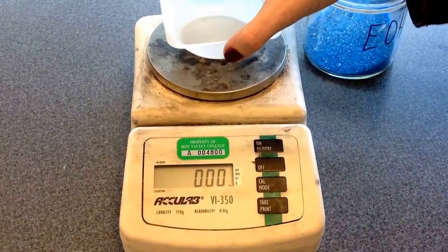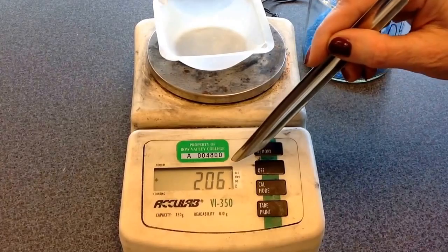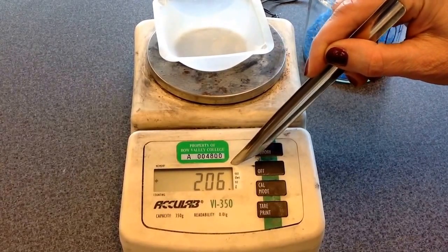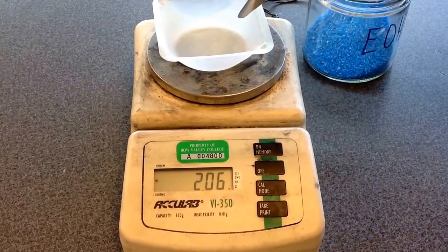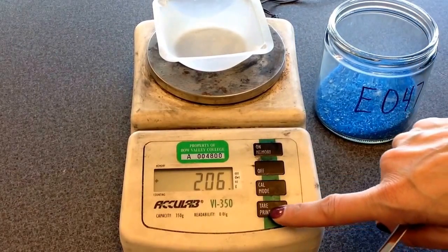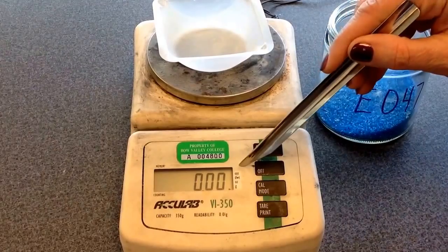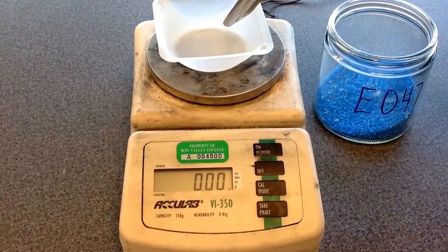Now we're going to put what's called a weighing boat on the scale, but as you see the mass of the weighing boat gets recorded, and we don't want to include the mass of the weighing boat — we just want to measure our sample. So what we're going to do is something called taring, which is zeroing the scale, and that sets it back to zero and removes the mass of the boat.